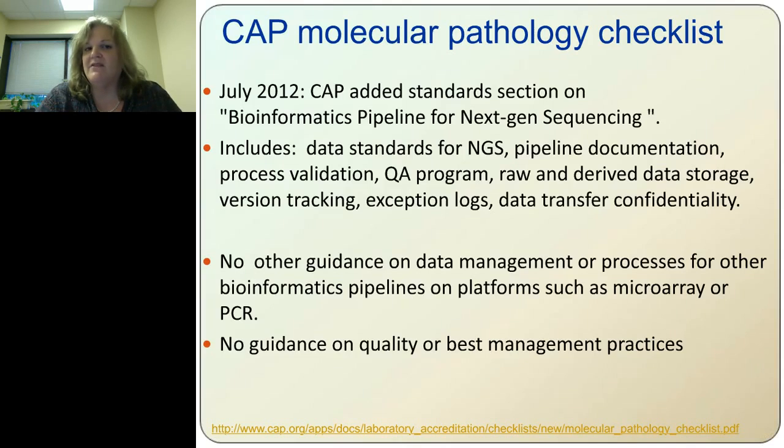So they've taken this great step for next generation sequencing, but we're still not completely there with workflows and data management for the other processes commonly used in laboratories, especially PGD laboratories. So there's also overall no guidance in CAP on their checklist for quality or best management practices.